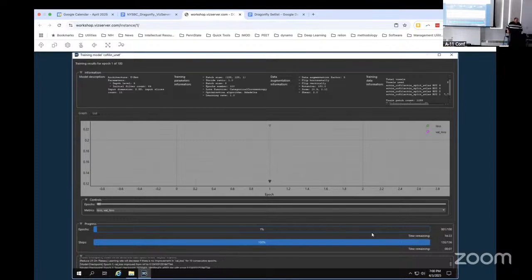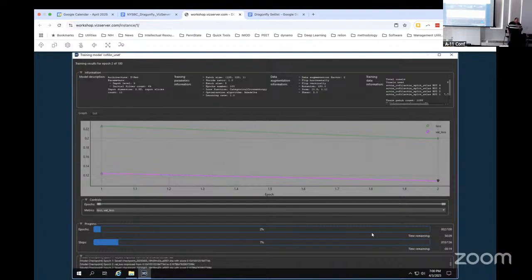All right, so this is a slightly larger data set. It's not that much larger, it's just more Z slices, so it would take slightly longer to train. Under which tab can you change the number of training sequences? Is it already trained? Yeah, I was just kidding.